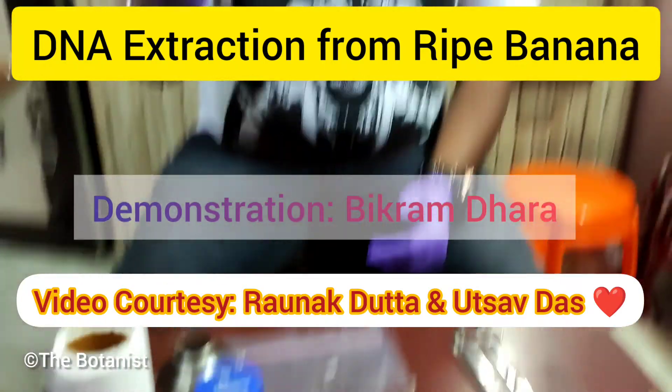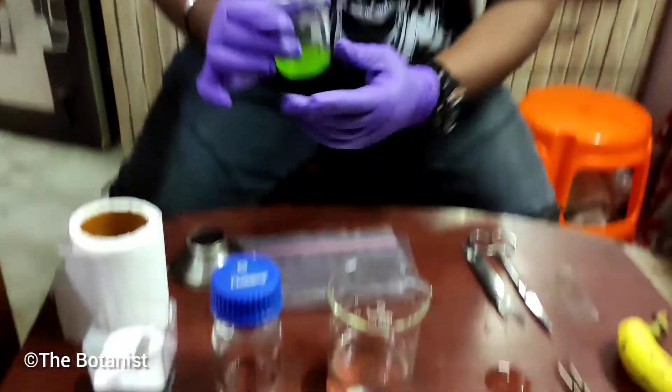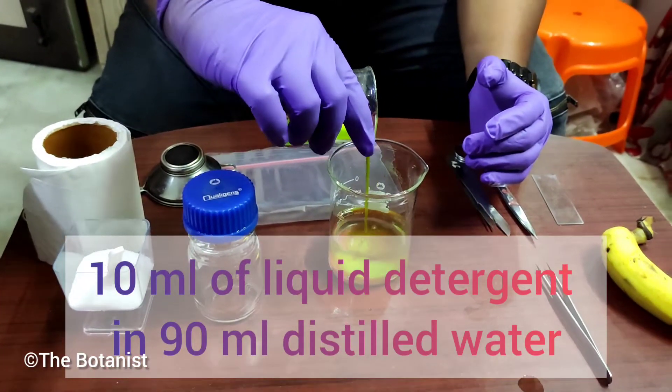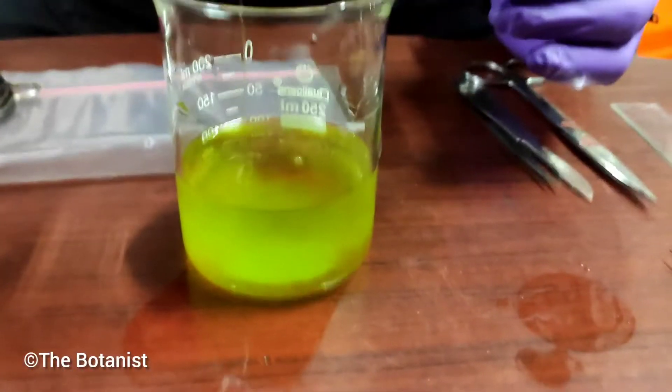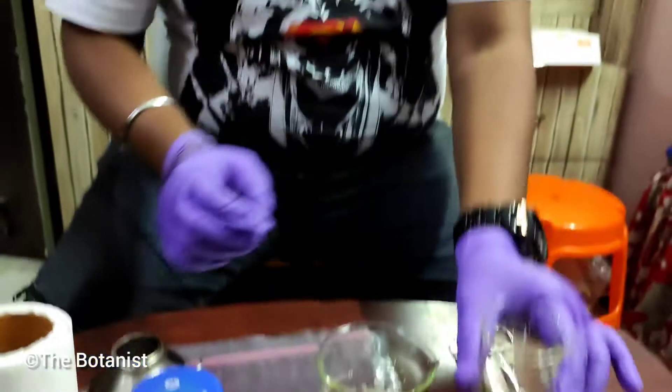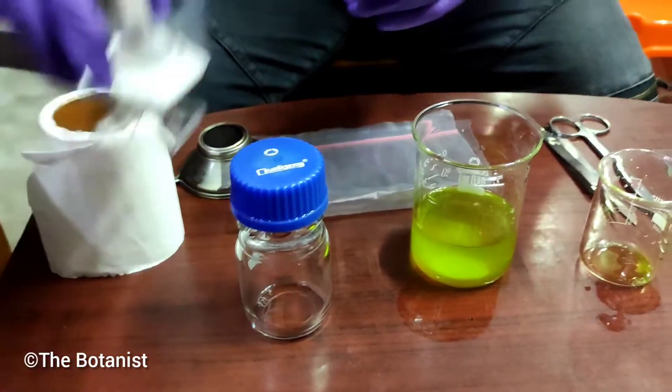Hello guys, this is Bikram Dhara from St. Xavier's College Kolkata. I'm back again with a new practical video — DNA extraction from a banana sample.